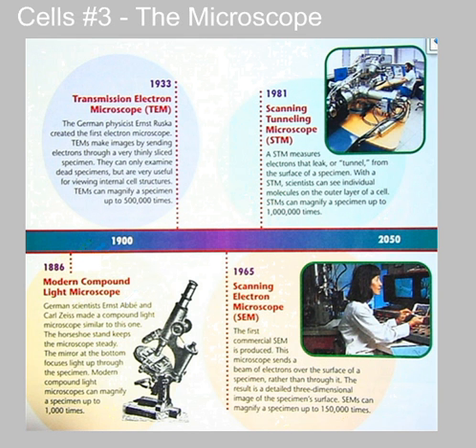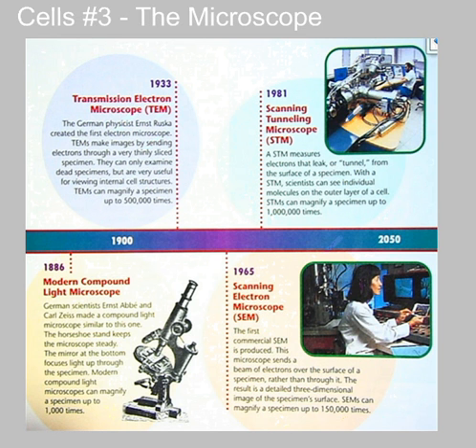These were compound microscopes using more than one lens — one lens in the eyepiece and objective lenses down in the nose piece. These lenses could be changed so that you could have different powers of magnification. Much more powerful microscopes called electron microscopes have been developed since — the transmission electron microscope, the scanning electron microscope, and the scanning tunneling microscope can magnify images much, much higher. Light microscopes can get up to about 1,000 times magnification, while these types of electron microscopes can get up to 1,000,000 times magnification.